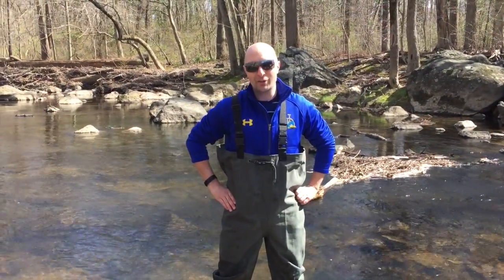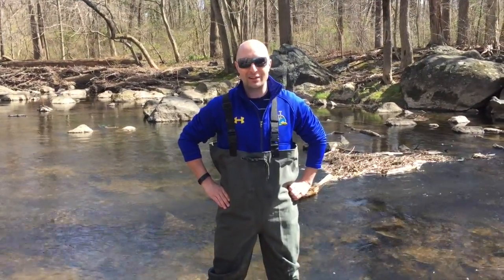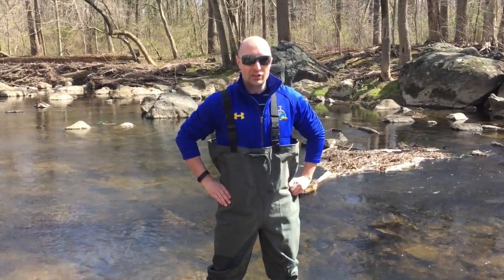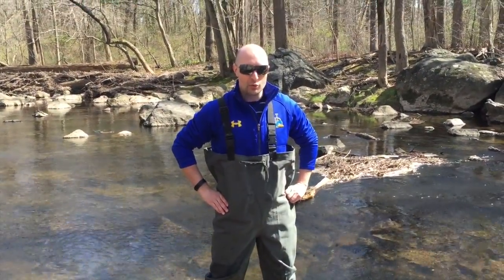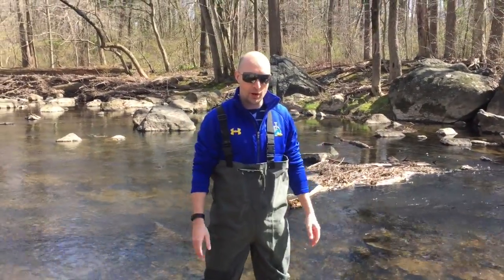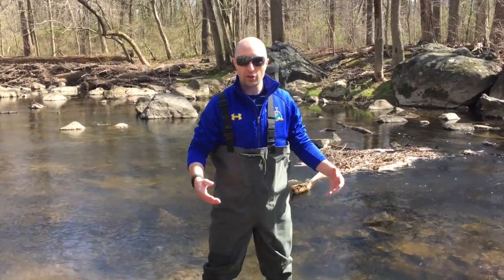Today I'm going to be teaching you about sampling for algae in your river. The first thing you want to do when you get to your site is to look at your river and establish what the prevalent substrates are. Here at Rittenhouse Park we have mostly rock with a little bit of sand.